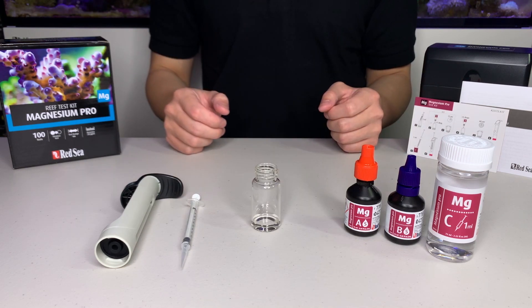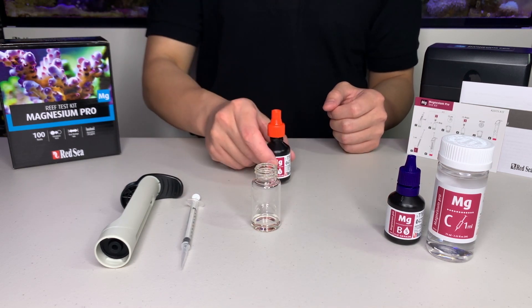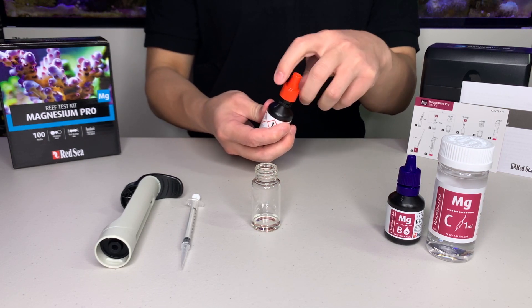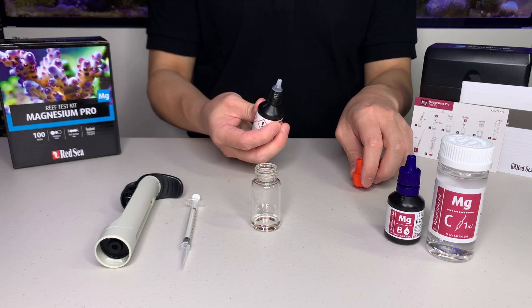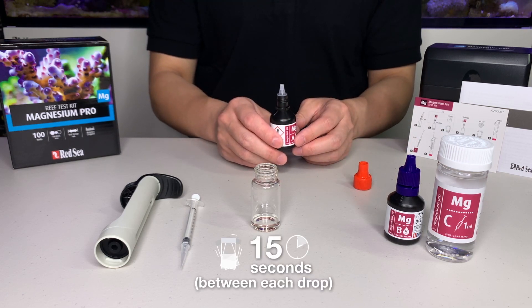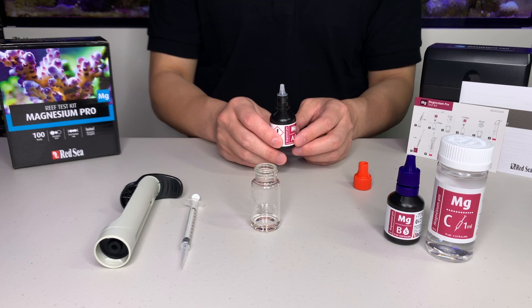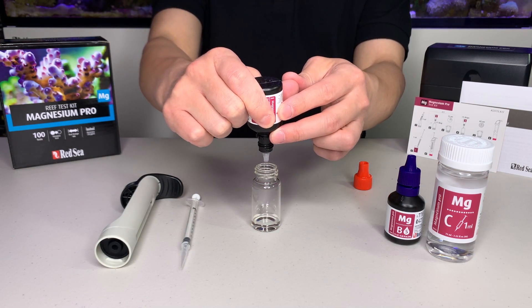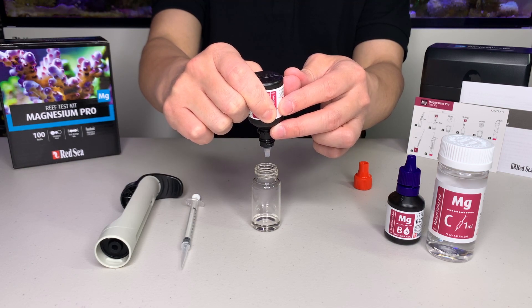We then take reagent A and we are going to put in 5 drops, but we are going to put in 1 drop at a time and we are going to shake the vial 15 seconds between each drop. This is the most critical stage in the testing procedure. Make sure the bottle is completely upside down so we can ensure they are full drops.